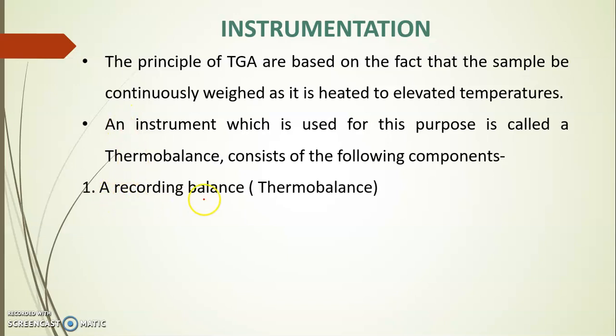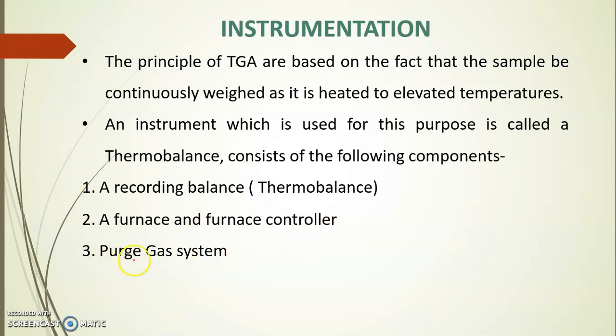First one is the recording balance, also known as the thermobalance. Second is a furnace and furnace controller. Next is the purge gas system. Then the sample holder and recording devices. So these are the different compartments present in the instrument. Now let us see these compartments one by one.